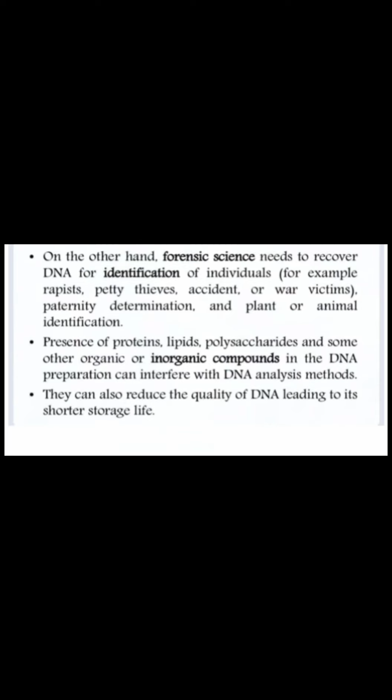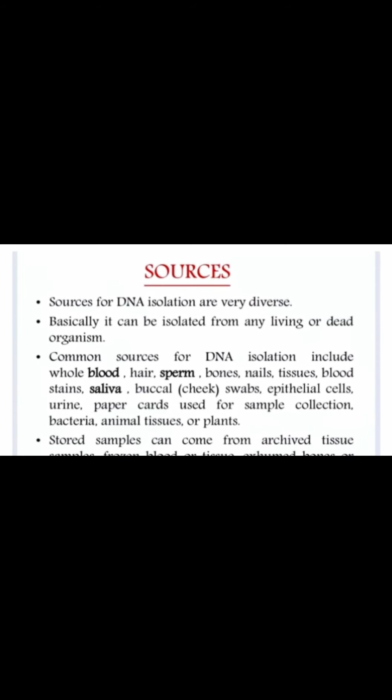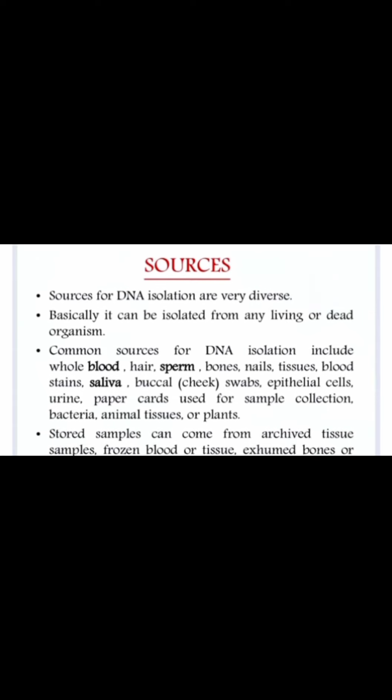Presence of proteins, lipids, polysaccharides and some other organic or inorganic compounds in the DNA preparations can interfere with DNA analysis methods. They can also reduce the quality of DNA, leading to its shorter life. So these are all the introductory part of the DNA extraction. All of you know how important DNA is in our life, but here we will start the things. Basically you have requested for the theoretical part, that's why I have shared this video.